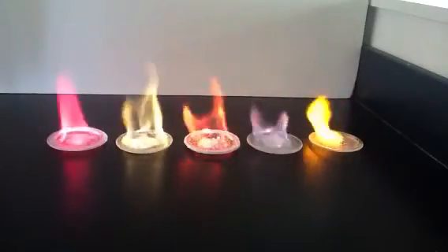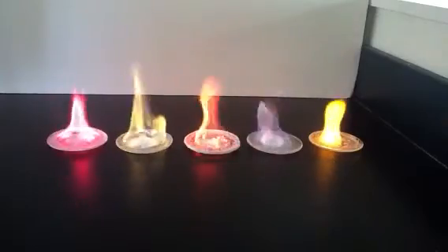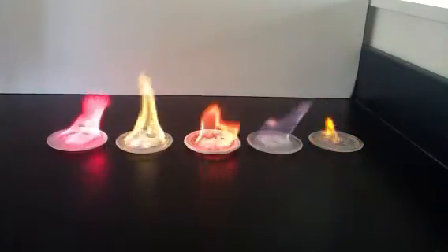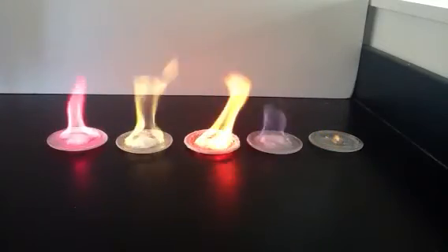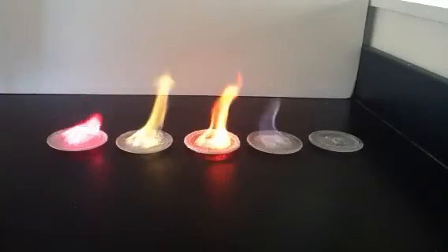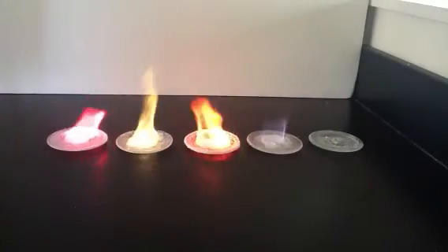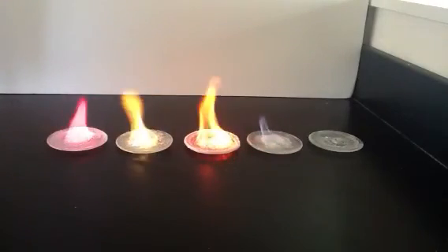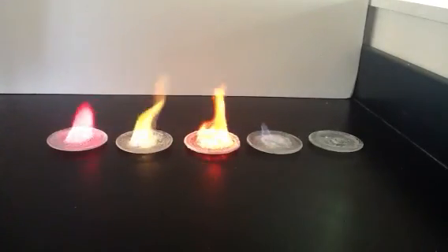This is useful for identifying unknown ions. It's also useful for things like fireworks, flares, duraflame logs, and things like that — you can make various colors based on which ions are present. The salts aren't actually burning; what's burning is the methanol.